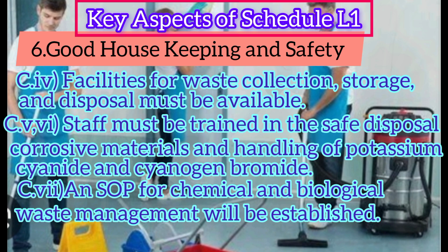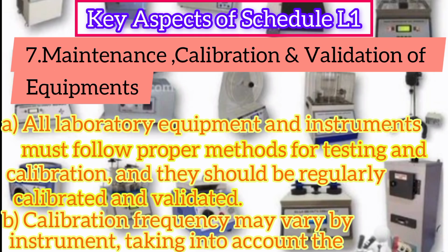Staff must be trained in the safe disposal, corrosive materials, and handling of potassium cyanide and cyanogen bromide. C. SOP for chemical and biological waste management will be established. 7. Maintenance, calibration and validation of equipment.